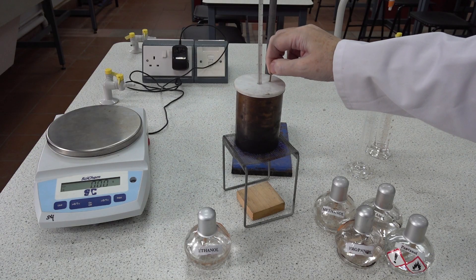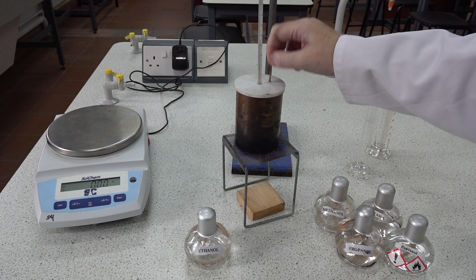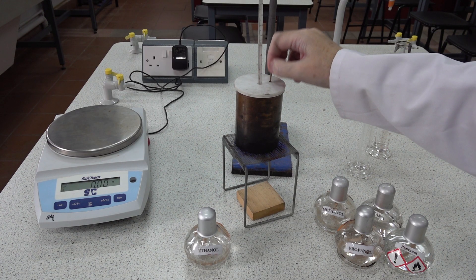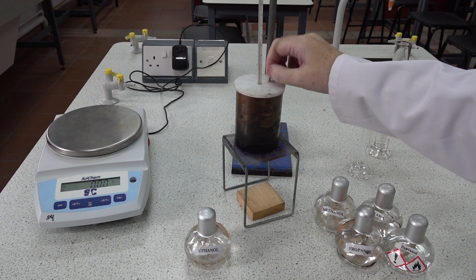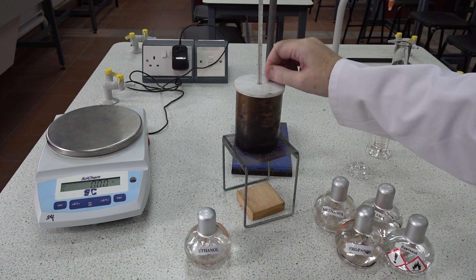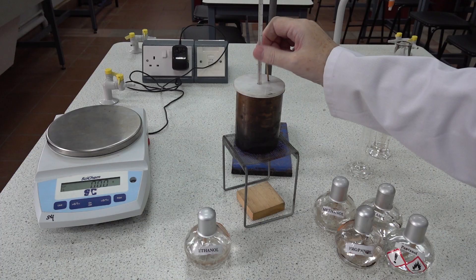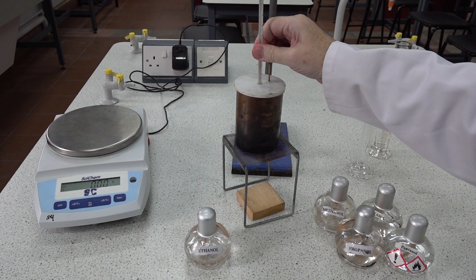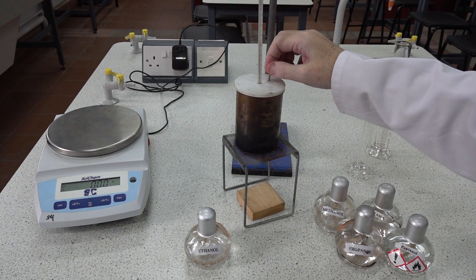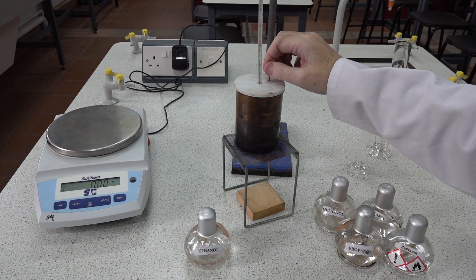It's important to keep stirring because heat has been transferred to the copper calorimeter and the water will continue to rise in temperature as that heat spreads throughout the system. In fact we've now reached 34 degrees — that looks like as much as we're going to get, so our final temperature is 34 degrees centigrade.